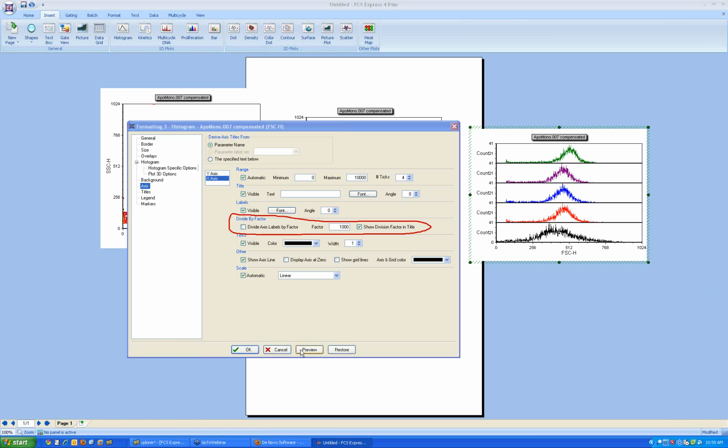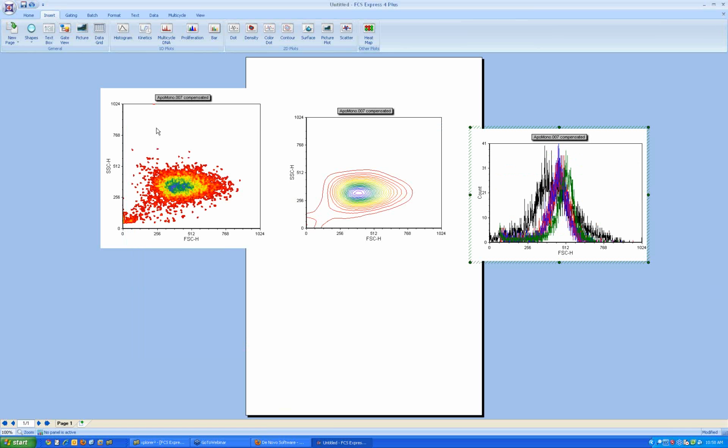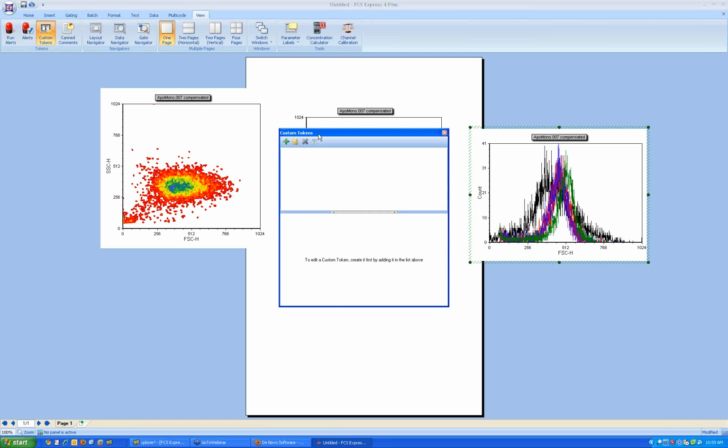Another thing that I will just touch on, but is going to be in more detail: tokens and custom tokens have been given a bit of a revamp. Nothing super significant, but they are dockable, and you can add custom tokens. And for people who have a lot of custom tokens, you can actually create folders. So you can call one my ratio custom tokens, and make another folder and call it my classification tokens, and then put different custom tokens in one folder or another.